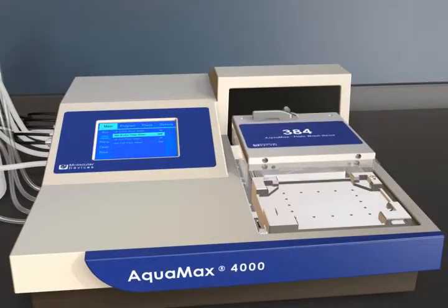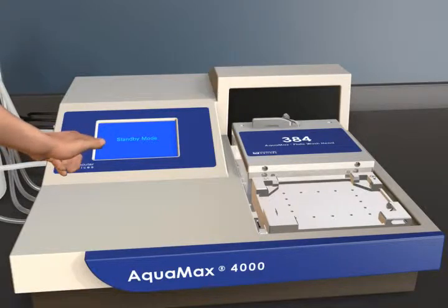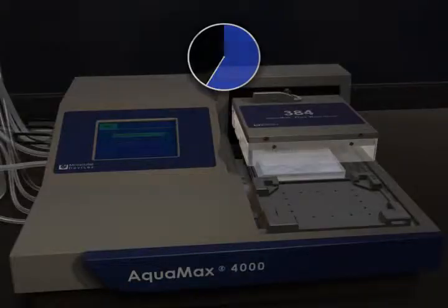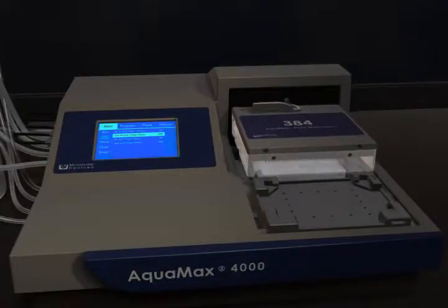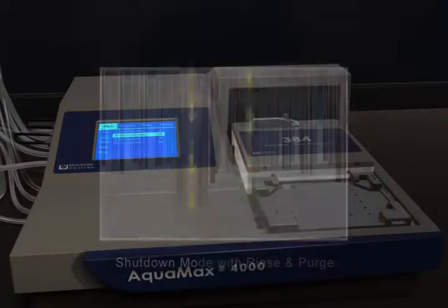The standby feature keeps the system primed and probe tips submersed in buffer for instant startup. Shutdown mode, with rinse and purge cleaning features, helps increase the reliability of the washer with continuous trouble-free operation.